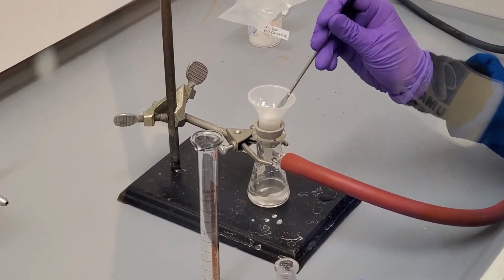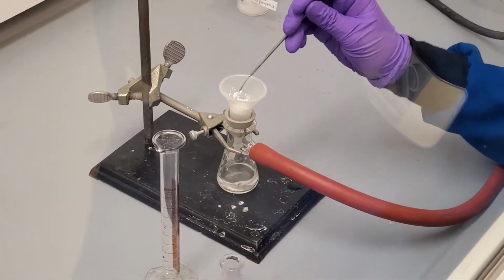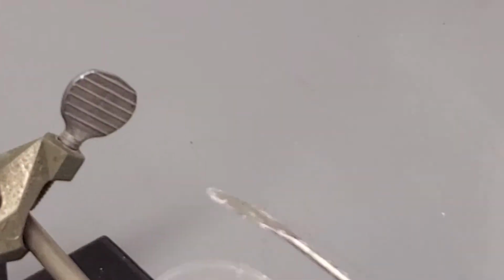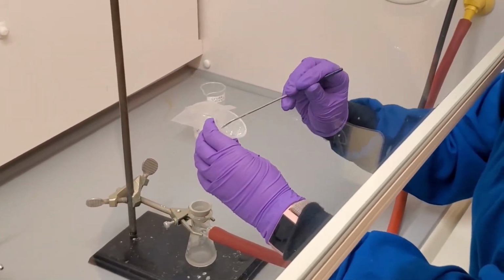Scrape the crystals in the Hirsch funnel to test the dryness and to allow the air to flow through the crystals so that the air can dry the crystals. We allow the vacuum to dry the crystals for a few minutes. After a few minutes, the crystals are drier and fluffier, but may still contain water.